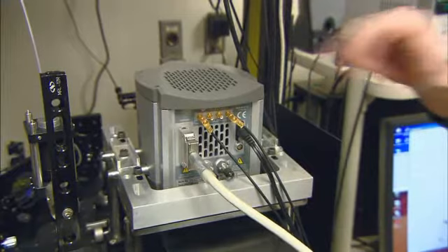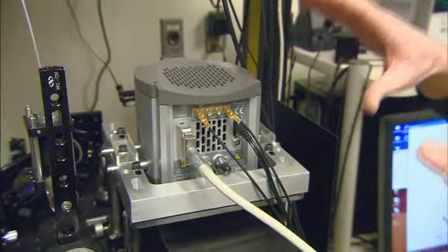That makes it reasonably fast. We're not as fast as a standard commercial confocal microscope, but if you're acquiring 500 times the data, going a little bit slower is a price you're probably going to have to pay.